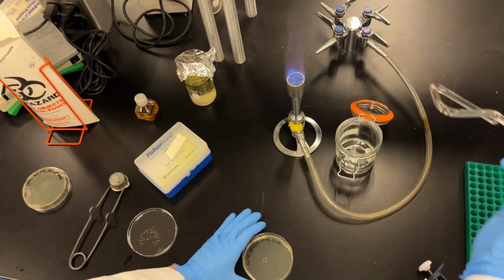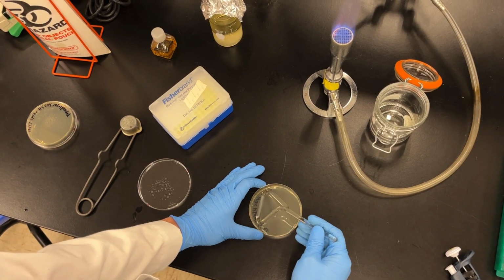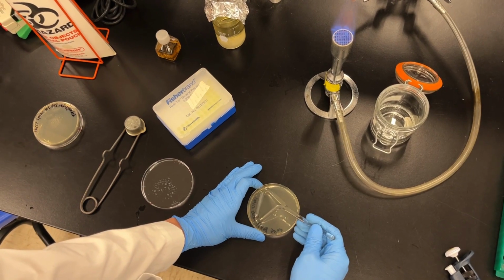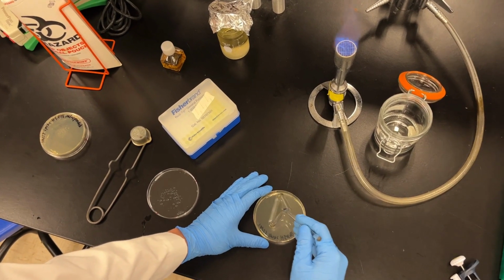If on the second pass you still see a little bit of that blue flame, then I'll pass it a third time. Cool the spreader by touching it on the 4 edges around the drop. Don't place it in the drop, otherwise you'll sizzle the drop, right? You just want to make sure that the spreader is cool, and then spread in a circular motion.